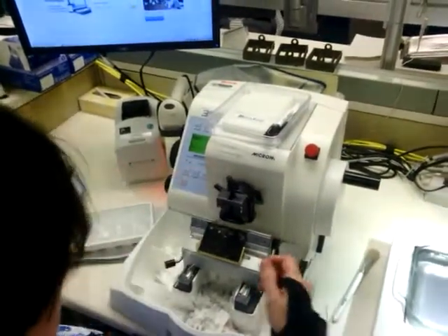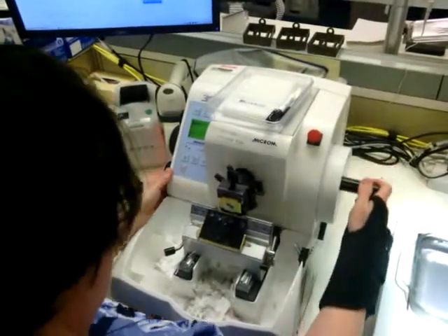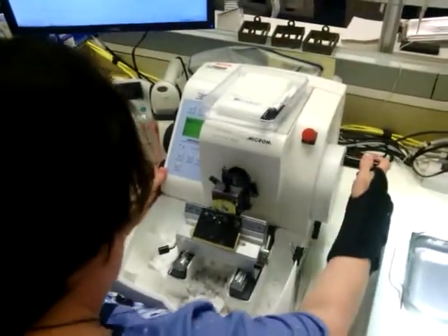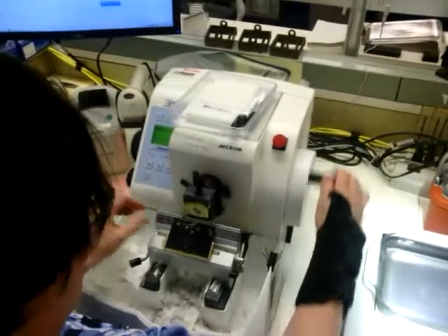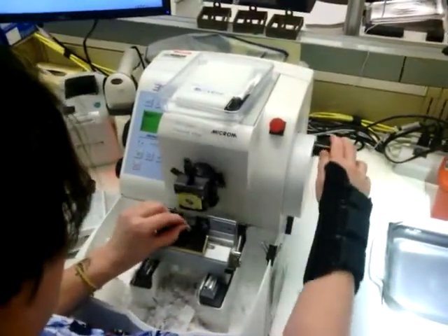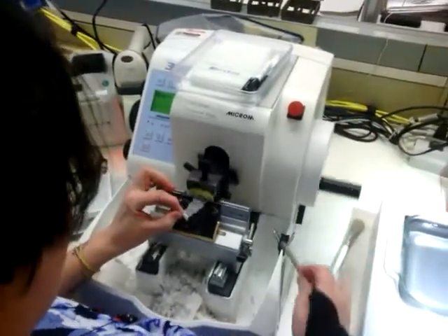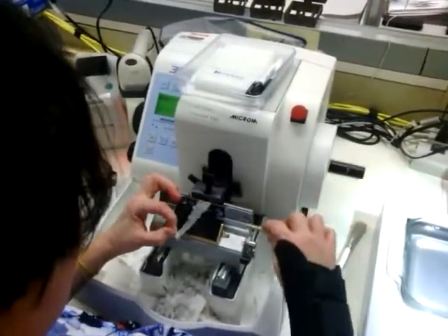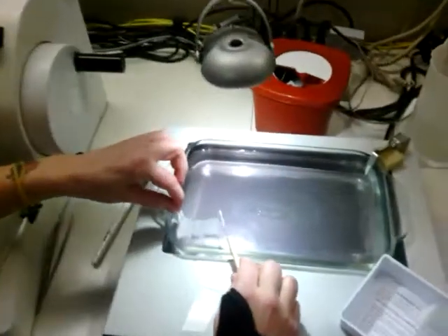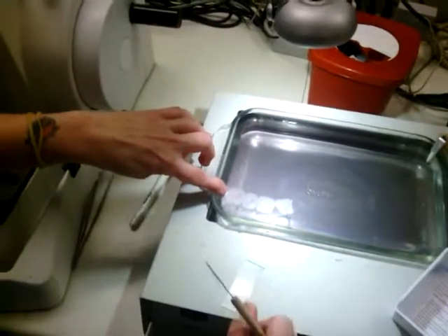I'll lift it up, lift my block with my tissue. I'll lift my ribbon. I can get a nice one. I'll lift it here. I can get a very nice one. I have to make sure all the wrinkles are out.